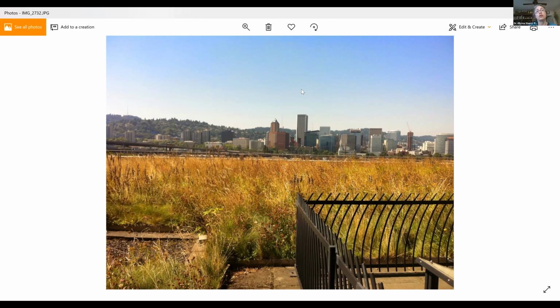They directed me to all of the manuals that are helpful for understanding how to download the data, all of the technical information. And I'm here to tell you also that we were able to walk the students through the steps in the manual for collecting data in a research setting, and they were able to do it without any obstacles.